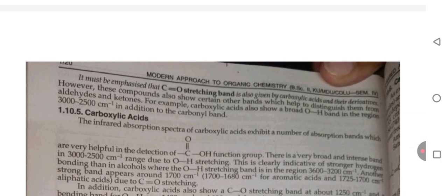It must be emphasized that the carbon double bond oxygen stretching band is also given by carboxylic acid and their derivatives. However, these compounds also show certain other bands which help to distinguish them from aldehyde and ketone. For example, carboxylic acid also shows a broad OH band in the region 3000 to 2500 cm inverse in addition to the carbonyl band.